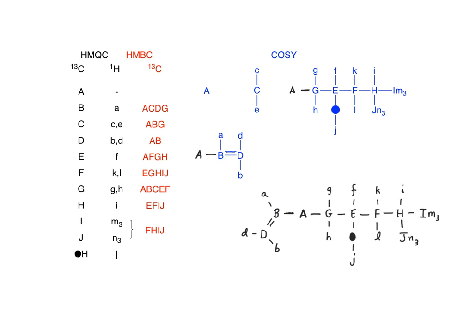We've now linked 9 out of the total 10 carbons. We just have to figure out how carbon C is connected.